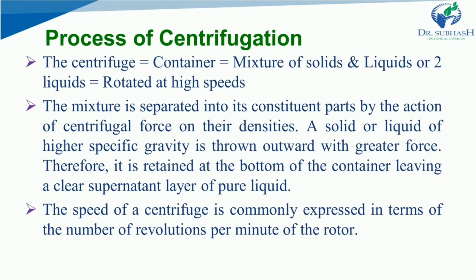Next is the process of centrifugation. The process of centrifugation is very simple. As I mentioned, the centrifuge, that is the equipment, contains a container which holds a mixture of solid and liquid or two liquids that are immiscible, and they are rotated at very high speed.